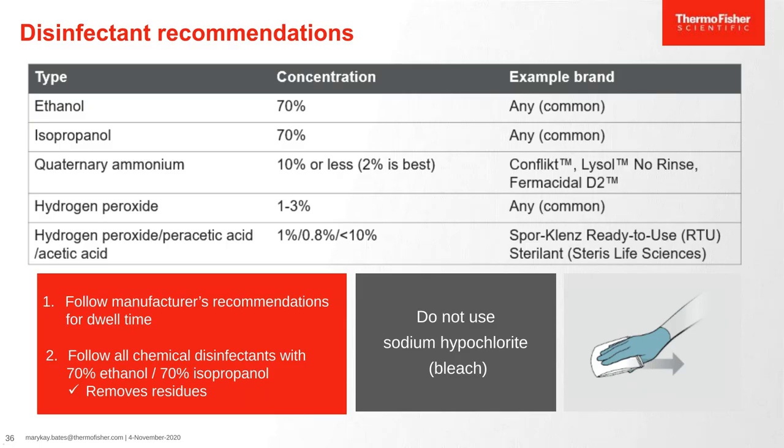So I mentioned disinfectant recommendations and how much I think about cleaning, and so we've done a lot of testing to ensure that commonly used disinfectants are compatible with our incubators. I do want to take this opportunity to say that I know all of you like to kind of drown your equipment in the clean room with disinfectant, but it's important to follow the manufacturer's recommendations when you use those disinfectants, and that includes the dwell time.